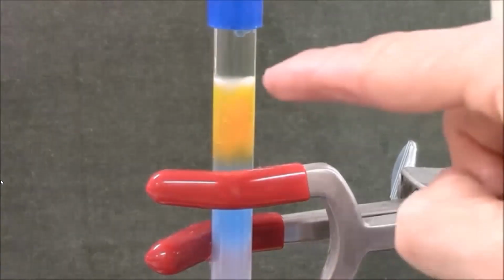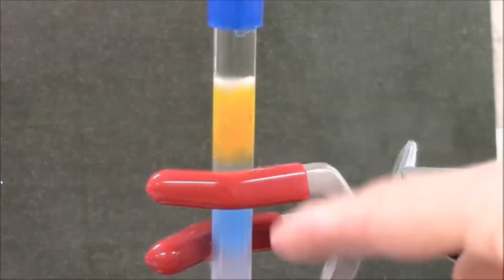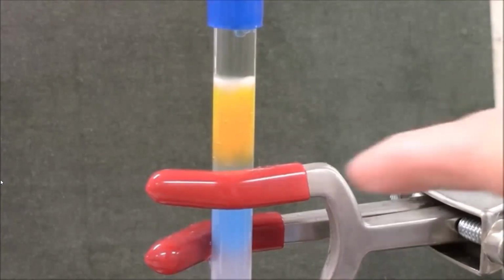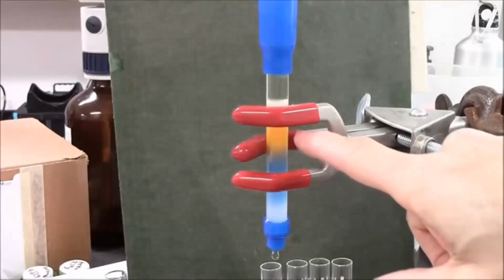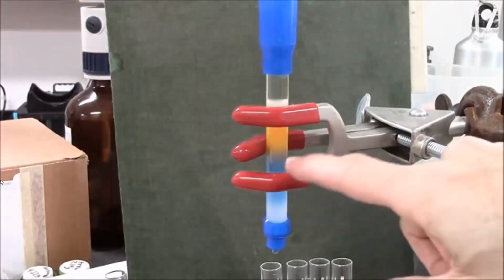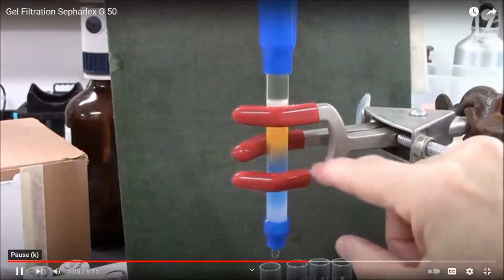All right, now you can start to see a little colorless layer on the top. That's perfect. All the colored molecules are in the G50 and they're starting to separate quite nicely. The yellow molecules are up here, the blue are down here. Still got a little overlap. So I may have overloaded this column, but we'll see. I'm hoping that before. Yeah.